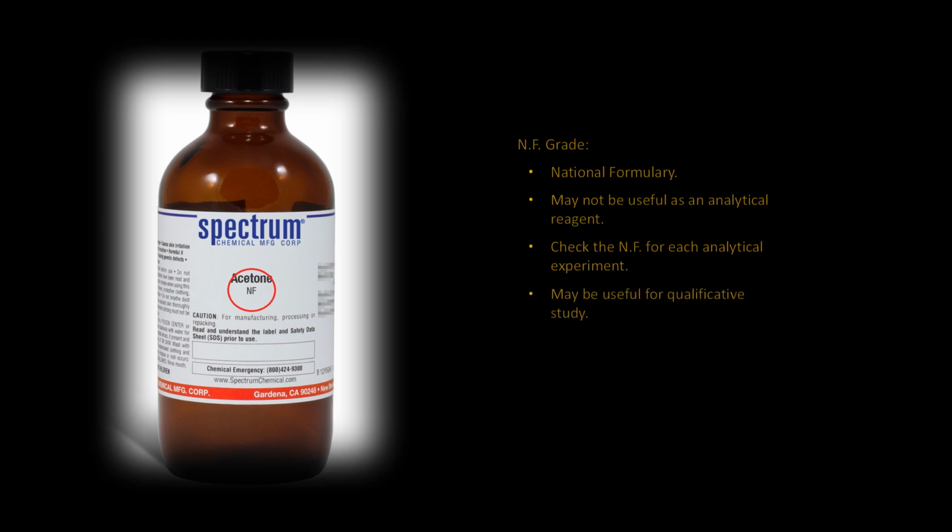NF, by itself, stands for the National Formulary. Now, this grade of chemical also may not be useful as a reagent for analytics. One would need to check the National Formulary list of chemicals to determine if the chemical to be used for a test or experiment will be adequate. This grade may be useful for qualitative analysis if the intent is to identify an element instead of an element's concentration.